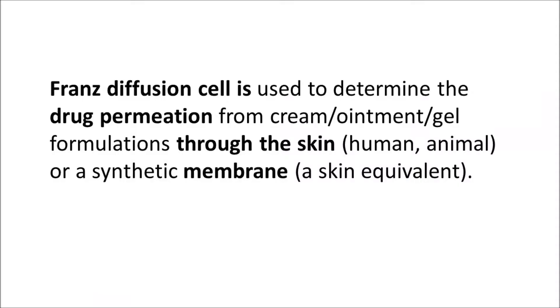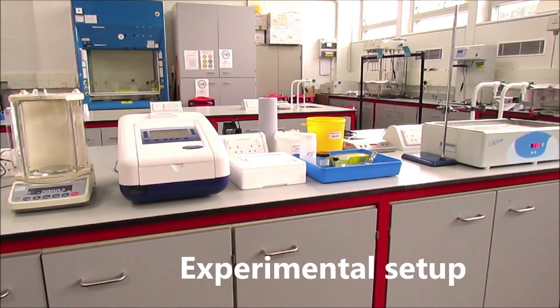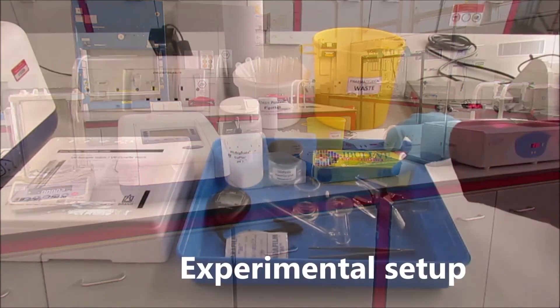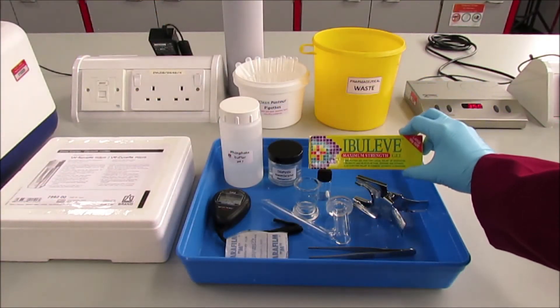For this experiment we will be using a FRANS cell, a special cell that could be used to determine drug permeation from various formulations through the skin or through other membranes.